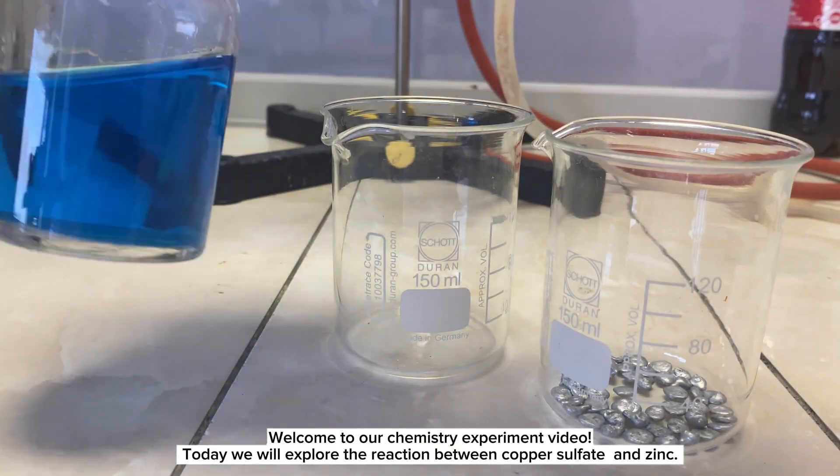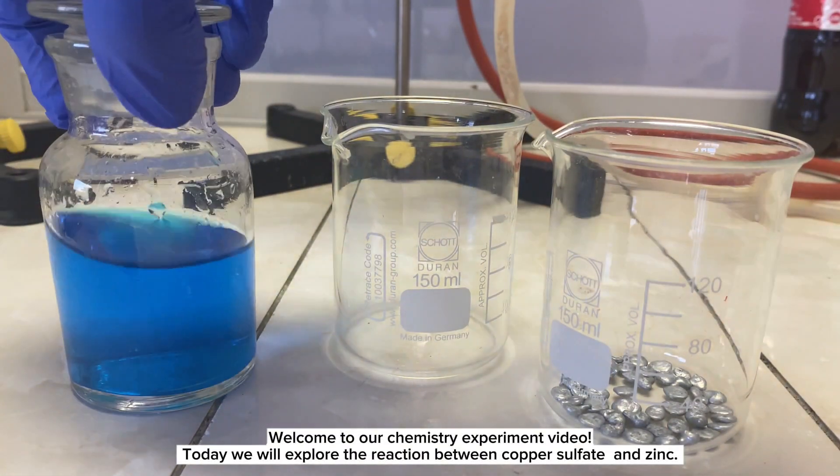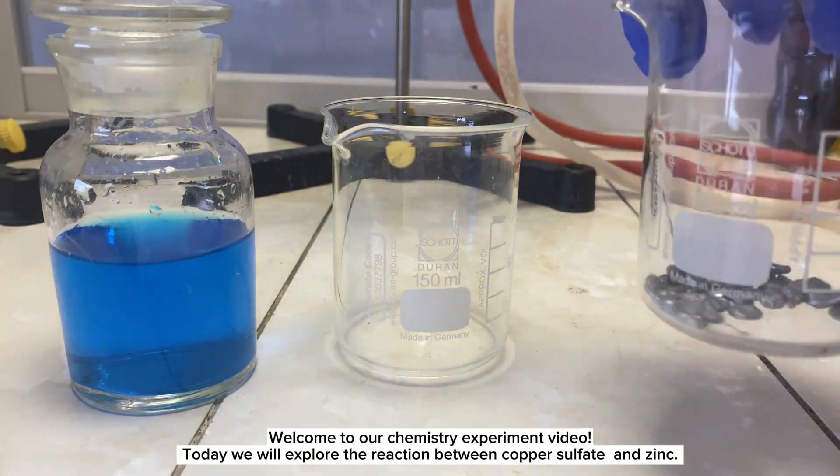Welcome to our chemistry experiment video. Today, we will explore the reaction between copper sulfate and zinc.